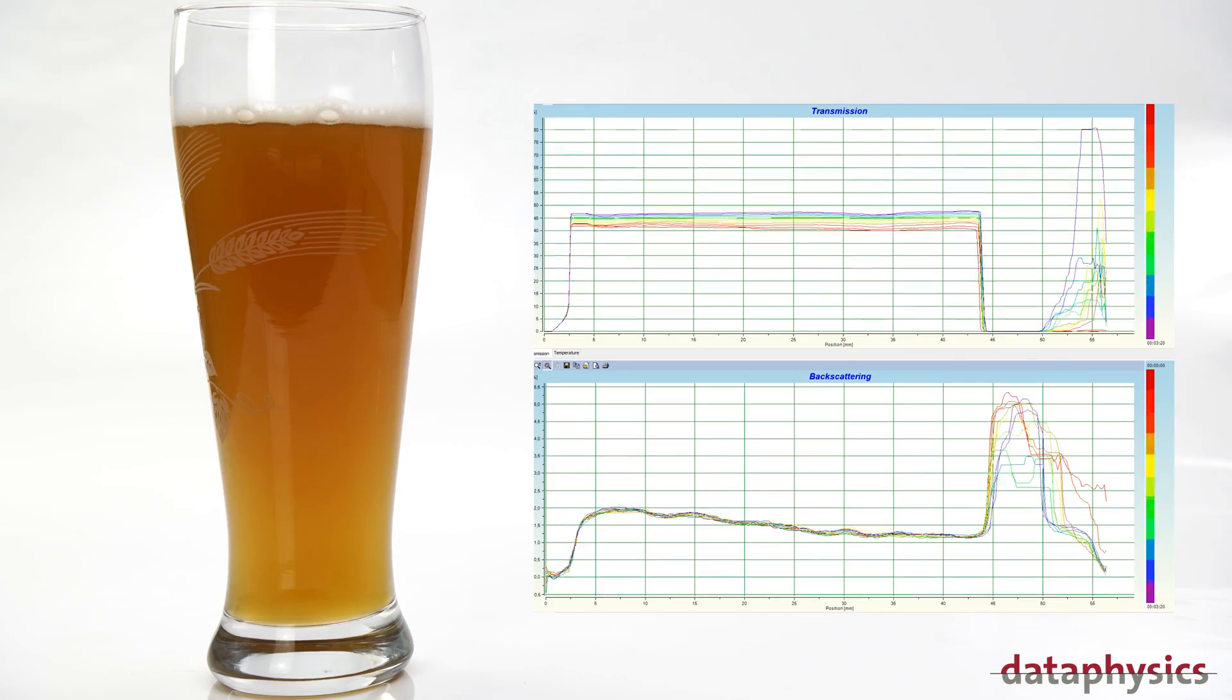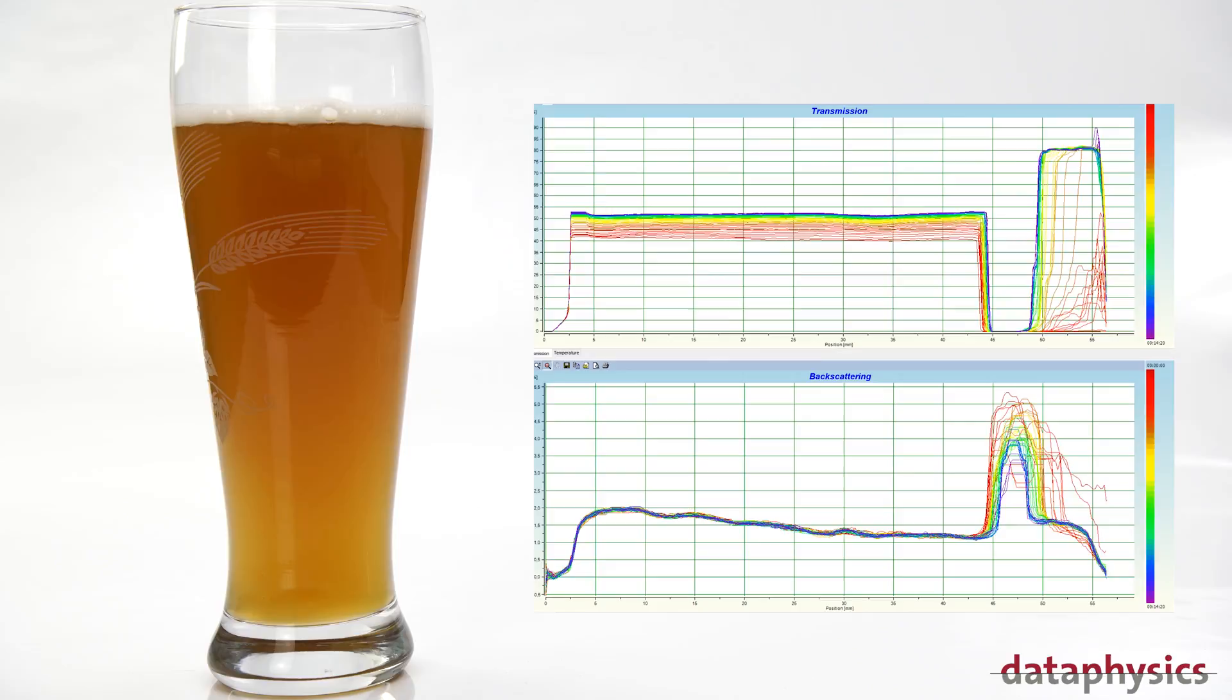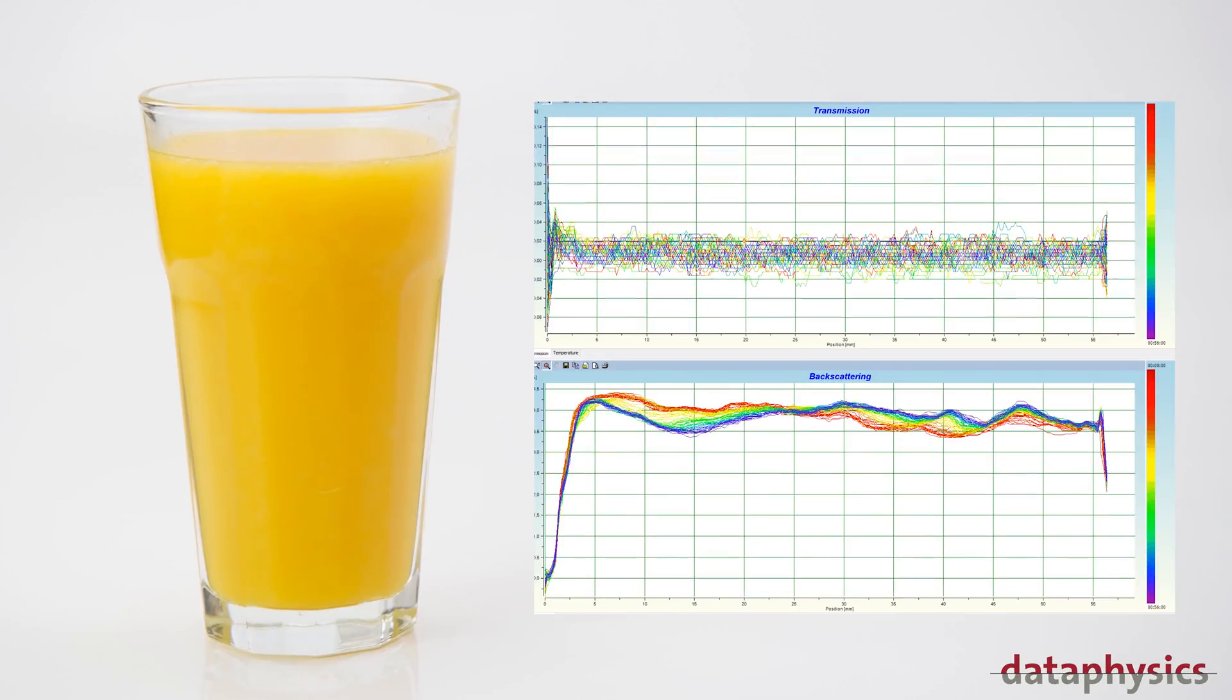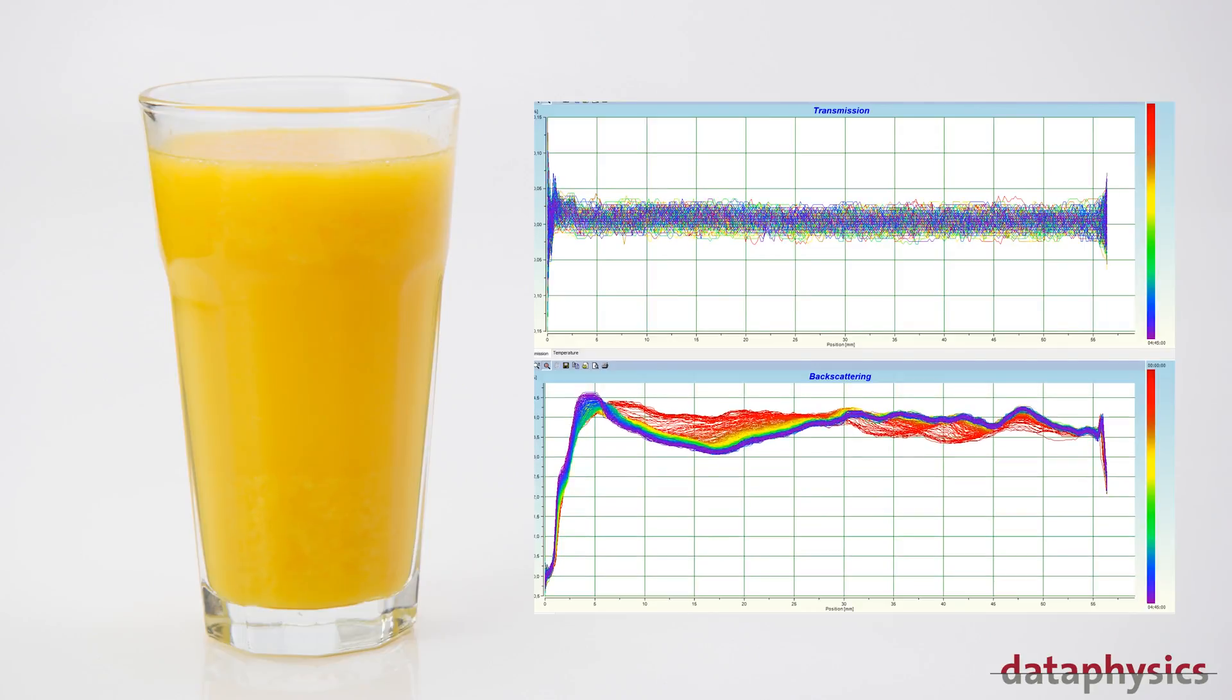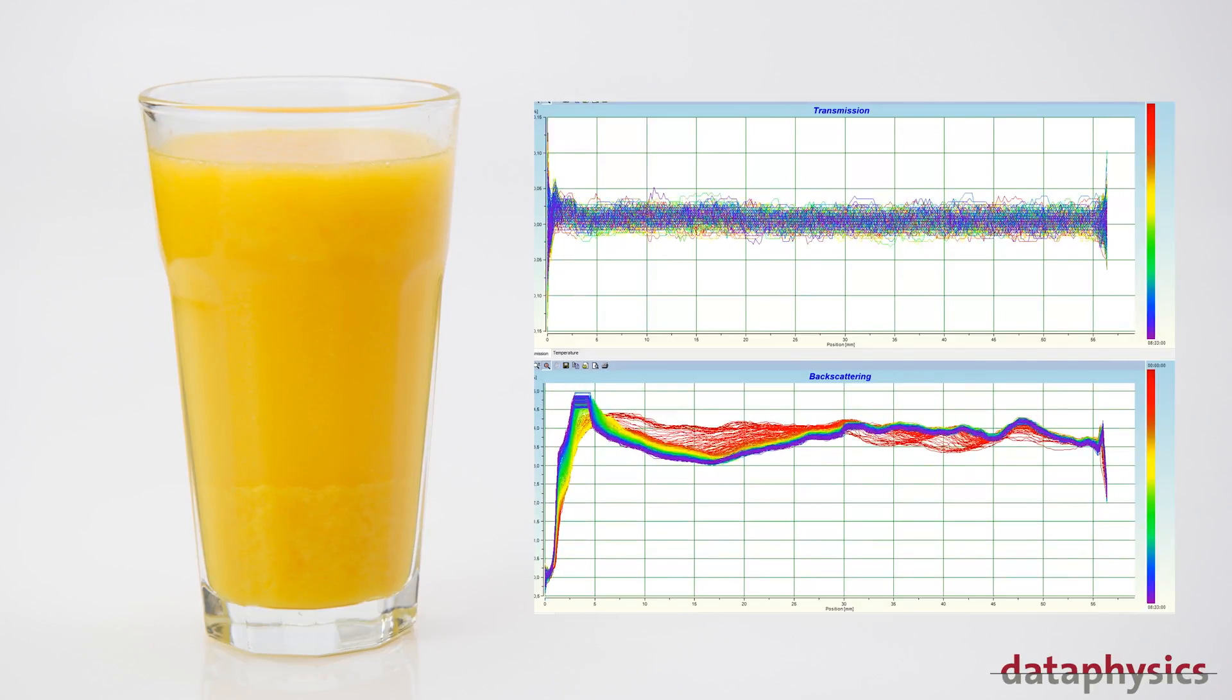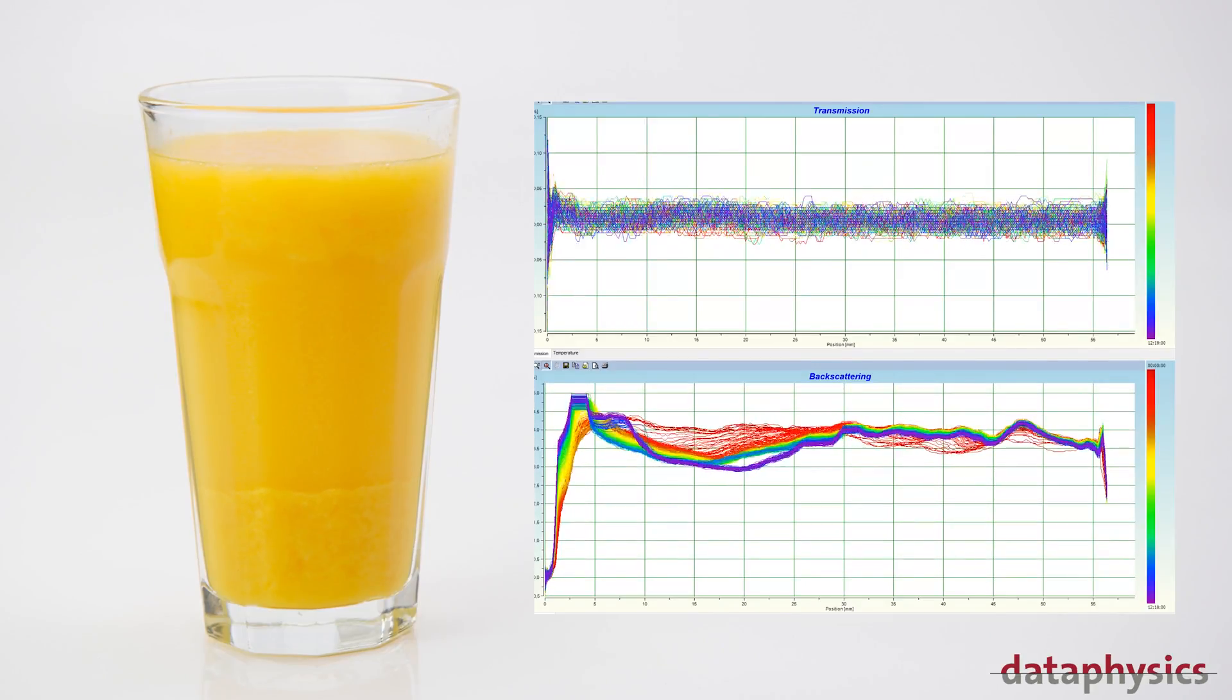Thanks to the MultiScan MS20, you are only a few clicks away from recognizing and quantifying unstable processes such as coalescence, coagulation, flocculation, sedimentation, and creaming. The intuitive software of the MultiScan MS20 will deliver real-time information on transmission and backscattering signals.